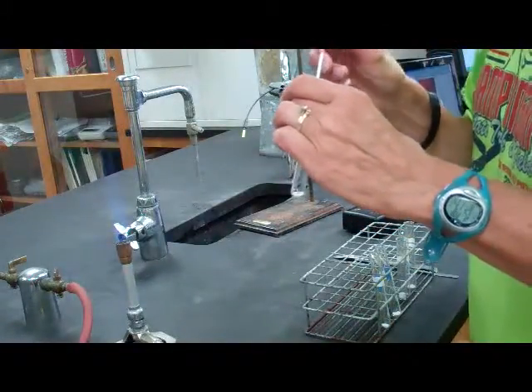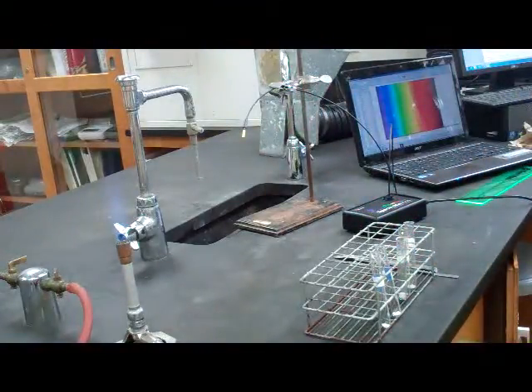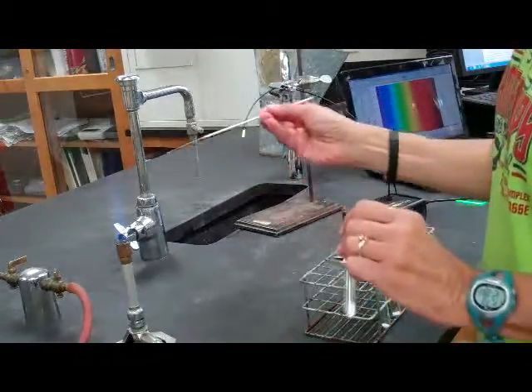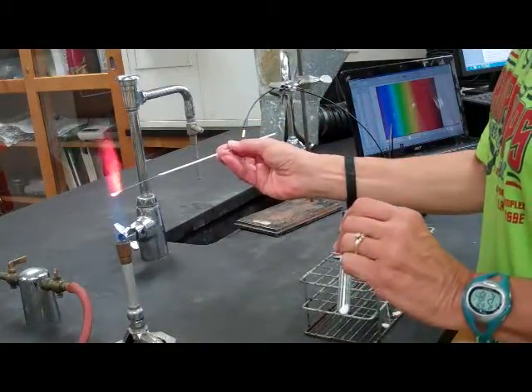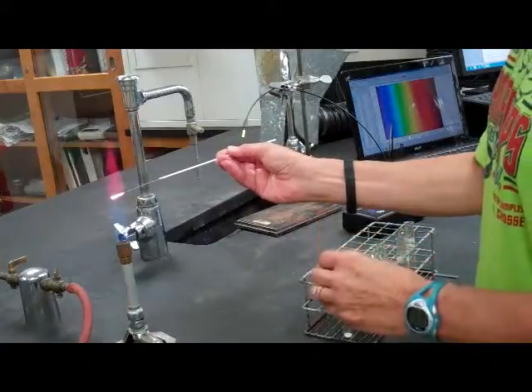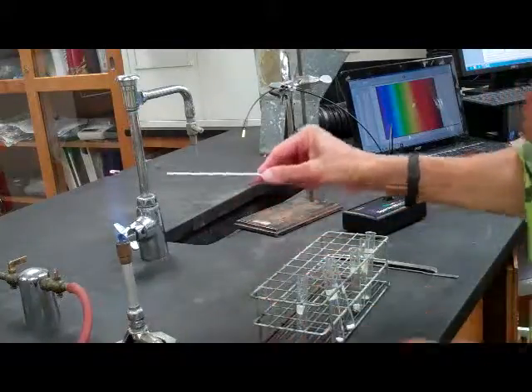So, dipping the loop in, collect a good sample of the lithium chloride. And at the same time watching the computer, let's see if we see a color change in that flame. Okay. You can definitely see a color change in our sample.